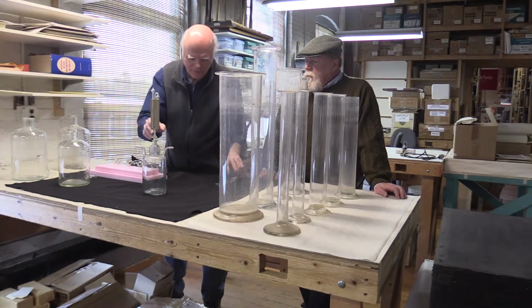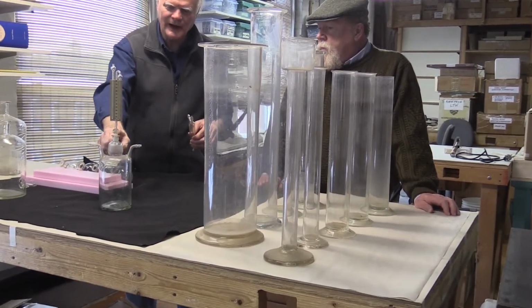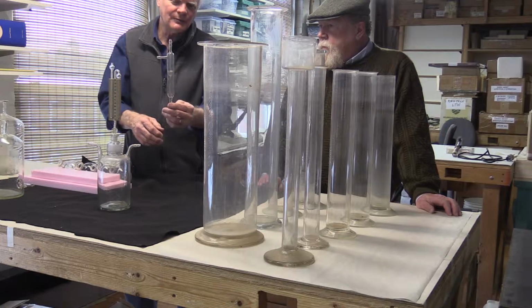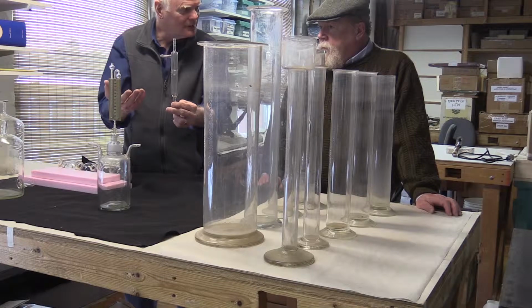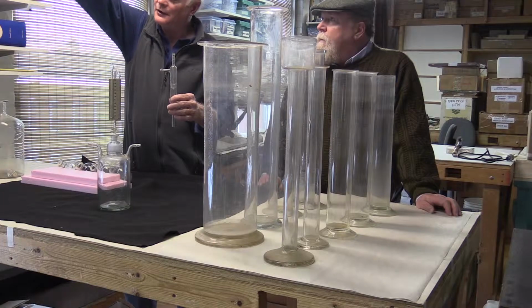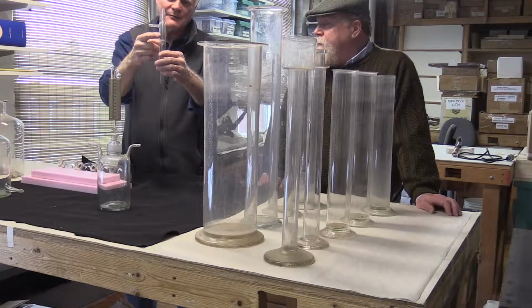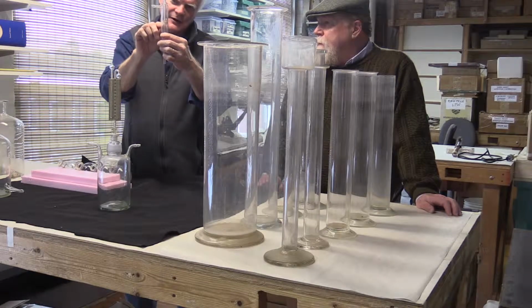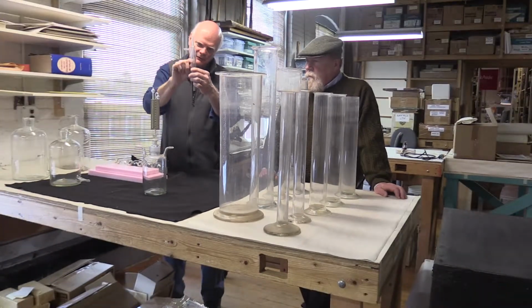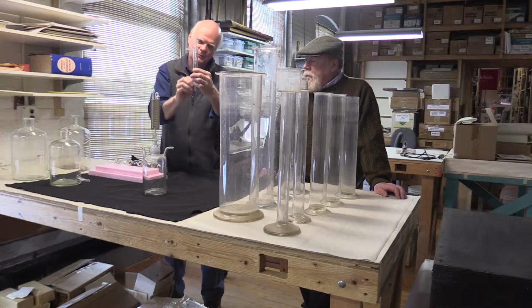And what this is for is determining whatever vacuum there is in this bottle. And the vacuum is produced by this pump. Now here's a piece of glass sculpture. What you do is, using these bottles filled with water up high, connect the port on the bottle to this, run water through this chamber. The water runs out the bottom, but it bypasses the little narrow orifice from this port right down there at the bottom of the funnel, and it draws air out of this as the water passes by.